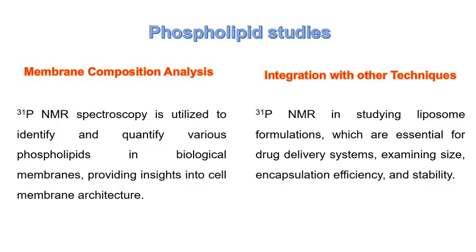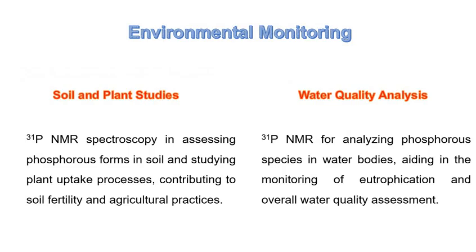Integration with other techniques. P31 NMR in studying liposome formulations, which are essential for drug delivery systems, examining size, encapsulation efficiency and stability. It is also used for environmental monitoring, soil and plant studies, that means water quality analysis.